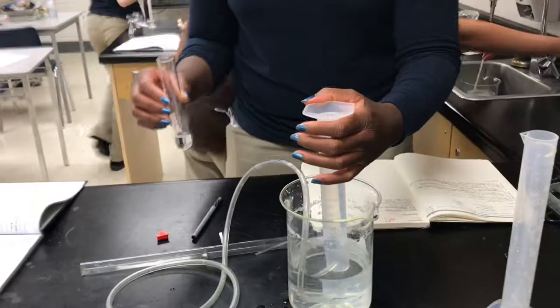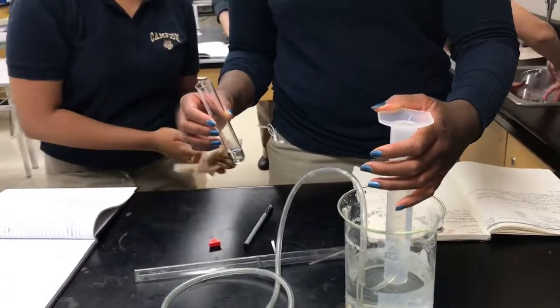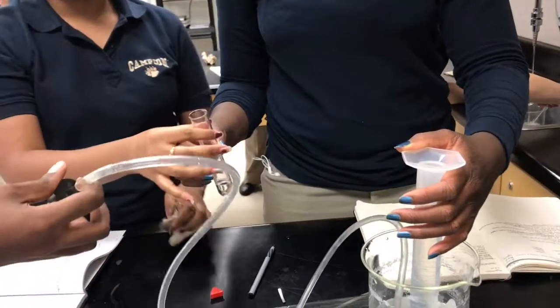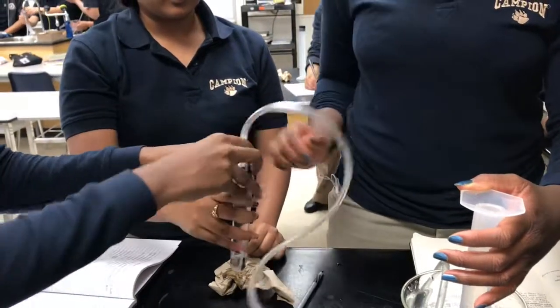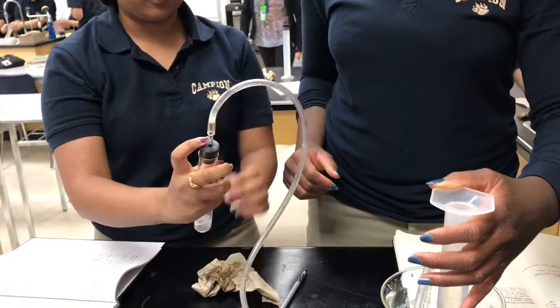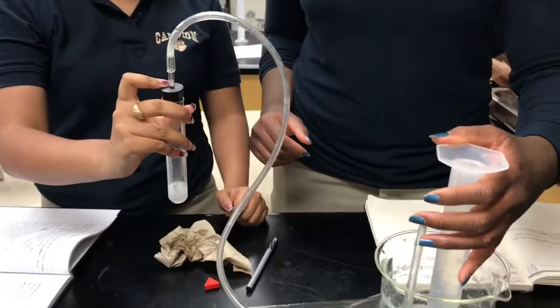So now the next step would be to add the magnesium to the HCl and put that gas collection device on right away. So who wants to drop the magnesium? Drop the magnesium now, quick. Should I shake it or leave it? Give it a sec. You can see our gas bubbles collecting.